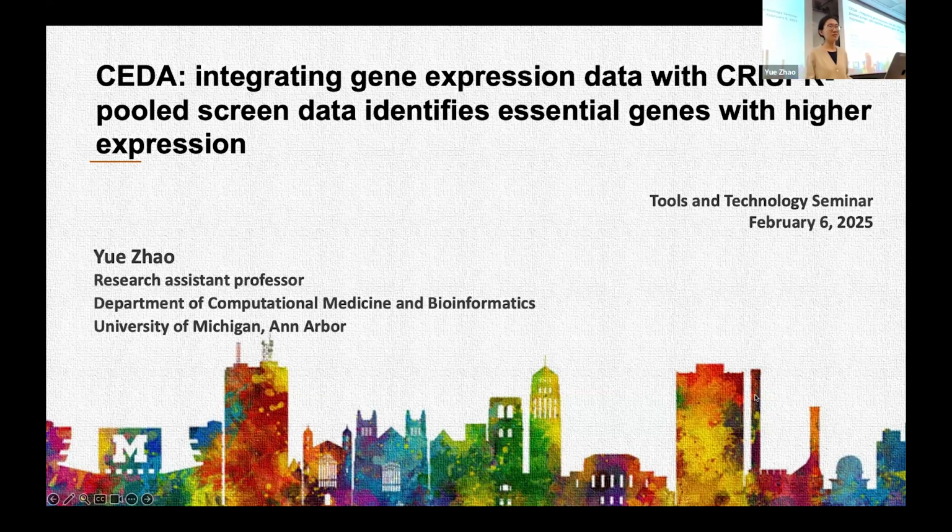My research interest is mainly focused on genomics and transcriptomics research, especially in neurodegenerative disease and cancer. Today I will present one tool developed several years ago, called CEDA. It's an R package, integrating gene expression data with CRISPR screen data. And the goal is to identify essential genes with higher expression level.